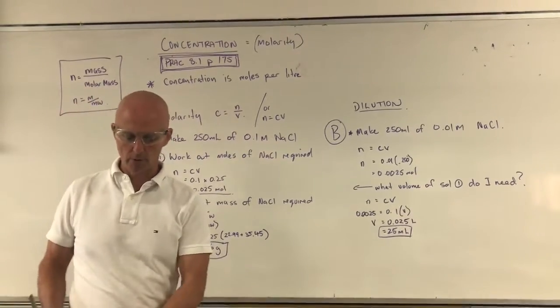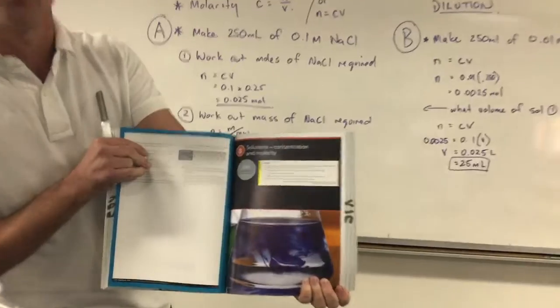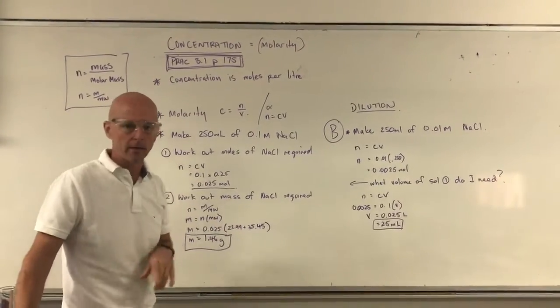G'day chemistry lovers. So this is going to be chapter 8, which is solutions, concentration and molarity. I'm going to do a selection of pracs for you, just so that because you're at home, you're going to be able to understand things.